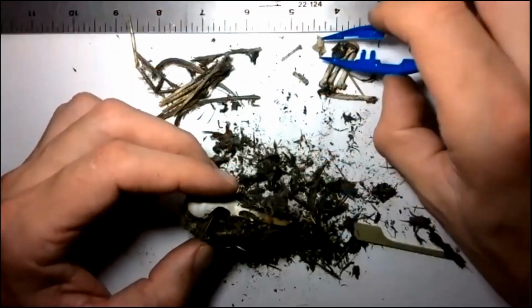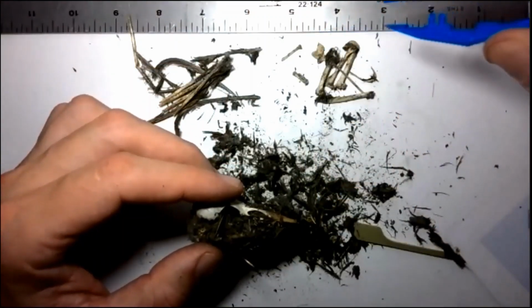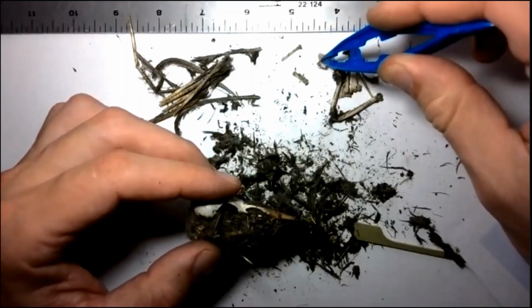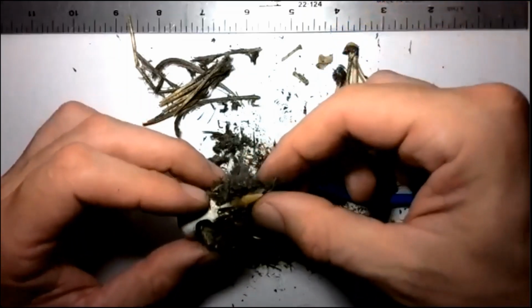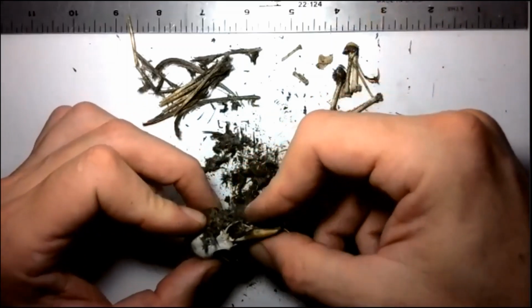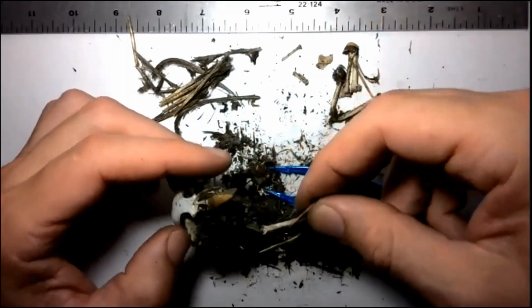I can see a fragment here. This could be part of the scapula. I honestly don't know. The chest bone is, again, like paper. It's very, very fragile. It's very interesting the way it feels. And it keeps pulling pieces here, and more feathers keep coming.